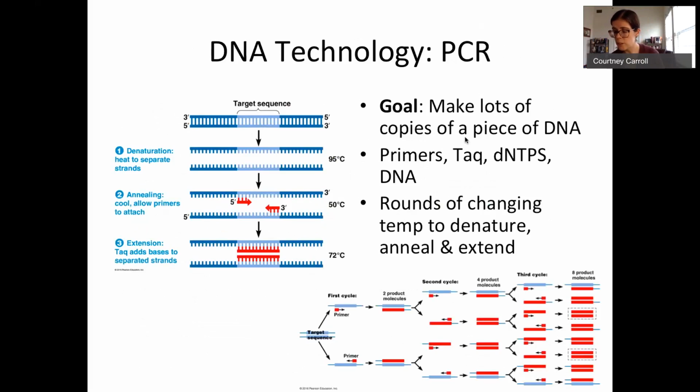So the most widely used is the polymerase chain reaction, or PCR. You use PCR in the lab when you want to create lots of copies of a piece of DNA, say from a crime scene or in a COVID test. PCR uses a temperature-stable polymerase. Remember, polymerase is the thing that copies the DNA. And this temperature-stable one is from bacteria.